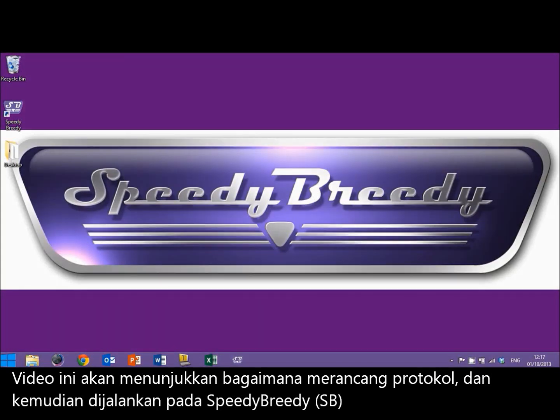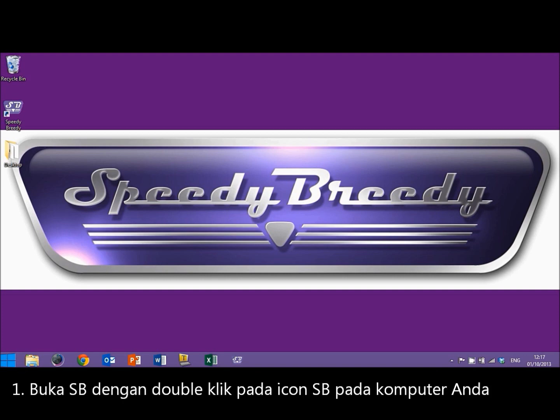Hi, this video will show you how to design a new protocol and get it to run on SpeedyBreedy. First, open the SpeedyBreedy software by double-clicking on the icon on your desktop.